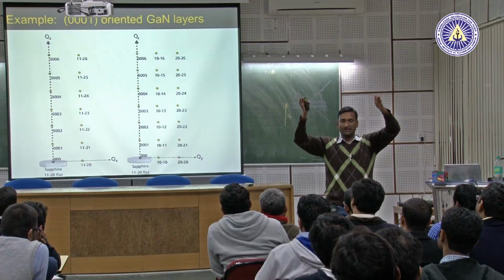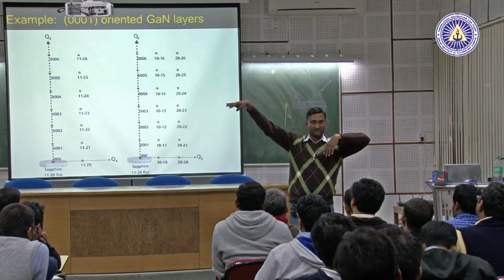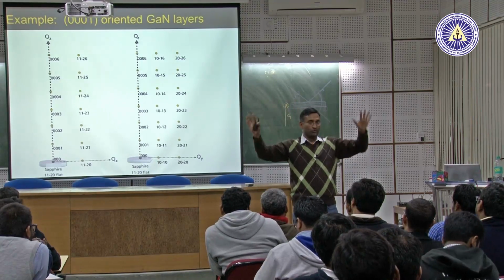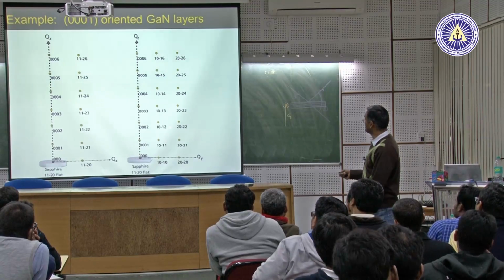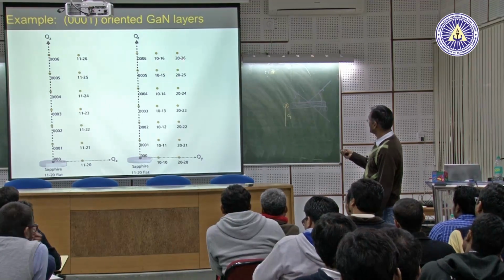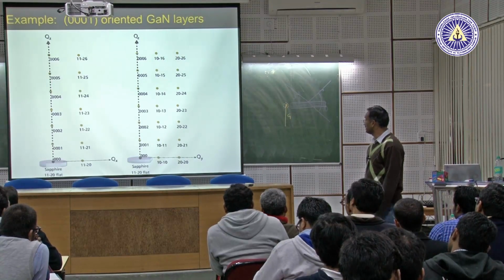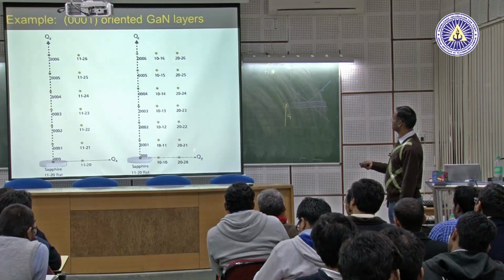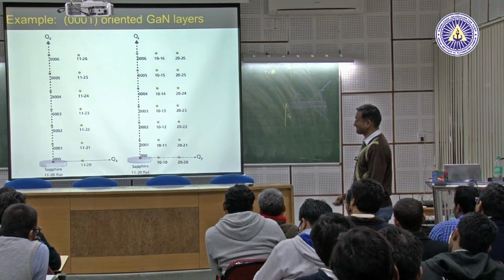Suppose you have a crystal. There will be certain sections along which you will have a lot of diffraction spots, and other oblique sections along which you will not get many diffraction points. According to lattice parameters and crystal symmetry, these are the two sections which give you the largest number of lattice points. Hence you have the freedom to choose many more points to do the analysis.